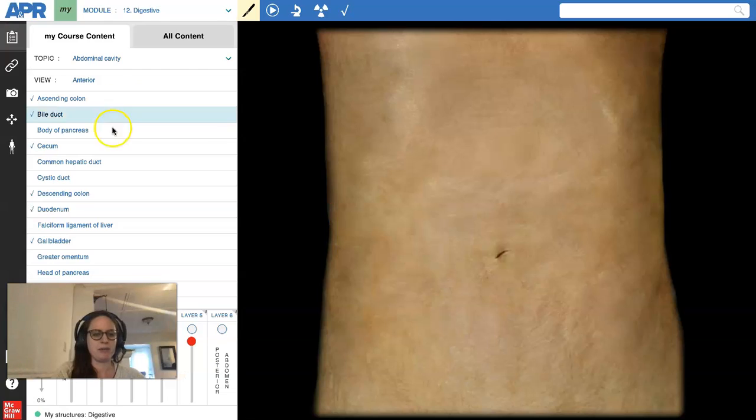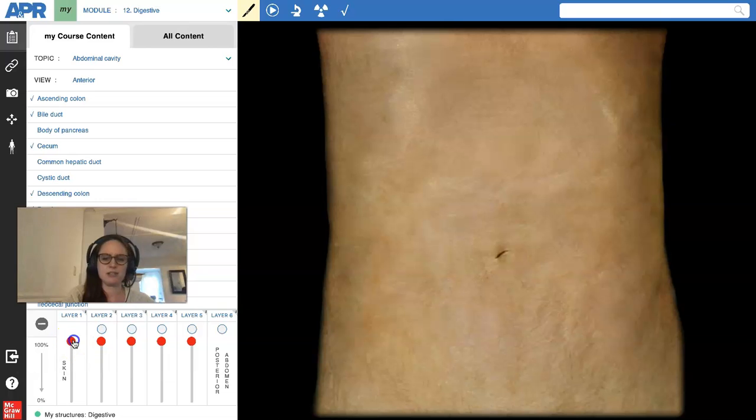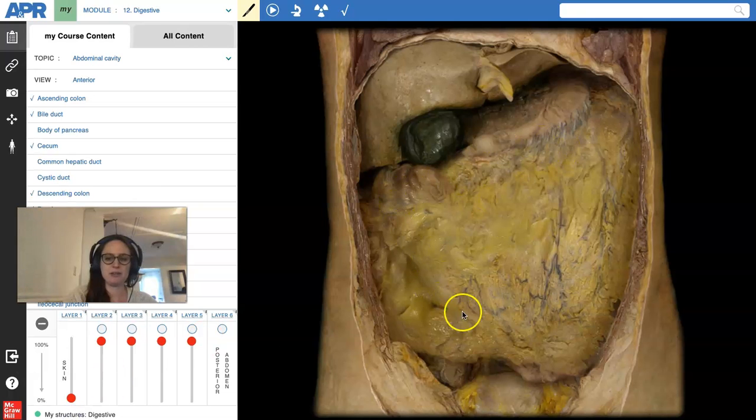So we'll go into the abdominal cavity. Let's do one of these. So let's just start peeling back the layers, literally. If this were a real-life dissection, you would probably do a U-shaped incision, but we're close to an O-shaped incision, and you would reflect the skin of the body wall back in this direction, and you would have to reflect a structure known as the greater omentum. Let's see if I can. There's that greater omentum that I'm talking about.